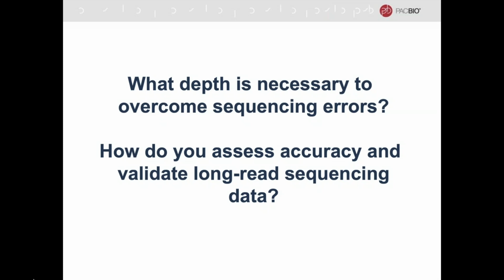As you can imagine, when you have four subgenomes all within your genome that are maybe 2 to 5% divergent sequence-wise, and you have subreads that have maybe 10 or even 15% sequencing errors, it's a bit of a black box when you're talking about doing all-on-all error correction. You don't know quite what the potential is for an area where those subgenomes are very similar to actually error correct what are truly different homologous sequences in those different subgenomes.